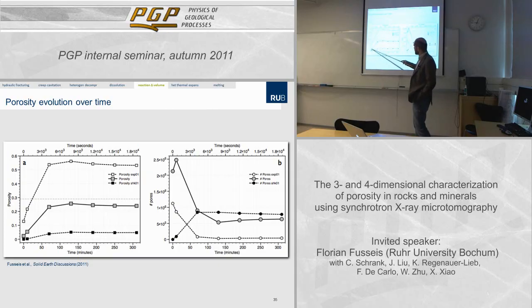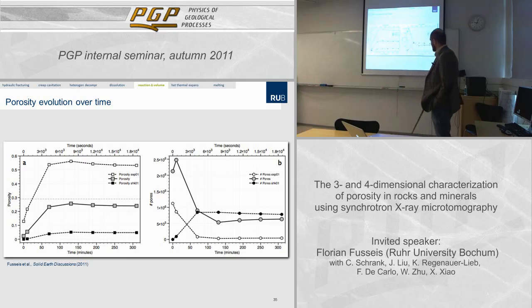You can see the front propagates through this volume, and it has finished doing so after 130 minutes, and that is also when the porosity has its peak, and it slightly decreases afterwards, which may be a sampling effect or actually have a physical meaning.